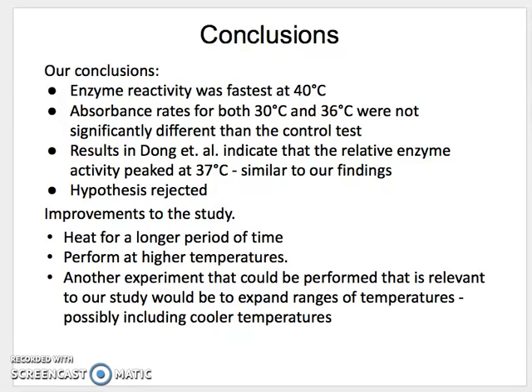Our experiment could also be performed at higher temperatures. A greater variety in temperatures would help the experimenters better understand where the enzyme activity peaks. If another experiment were to be done, a greater variety of temperatures and more trials would be very effective.